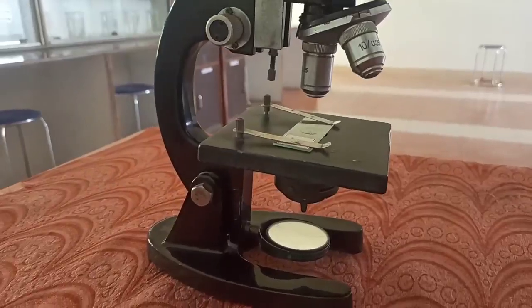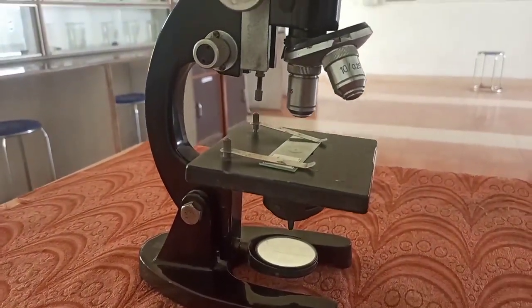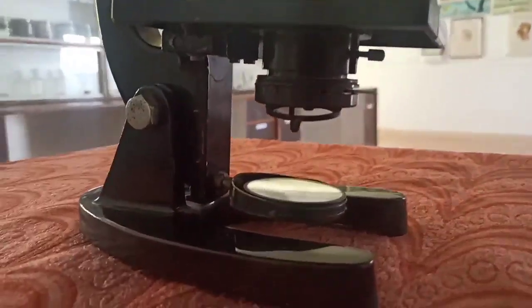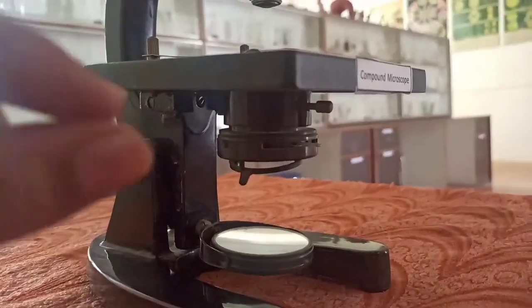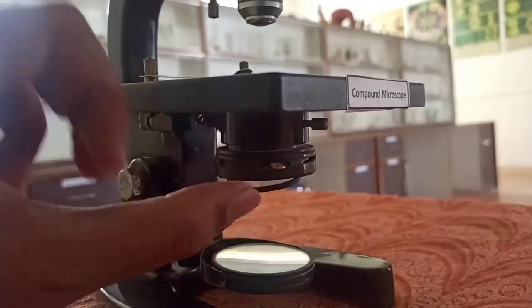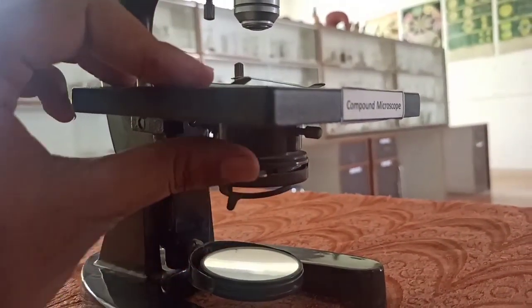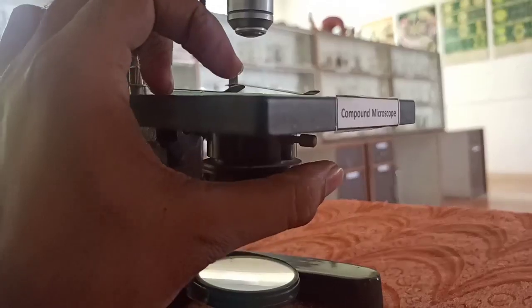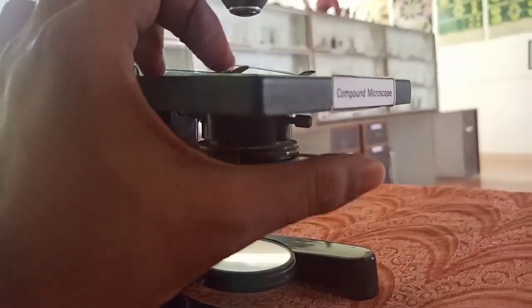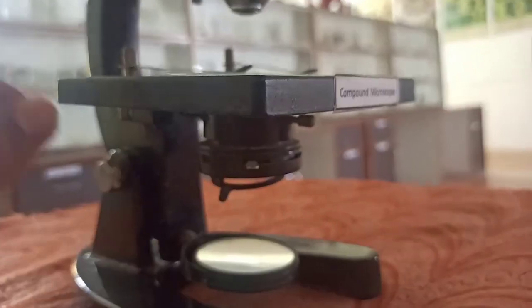So these are some parts of the microscope, and in this way the microscope works. One part here remains — we will have a look at that as well. Here is a component called the diaphragm.